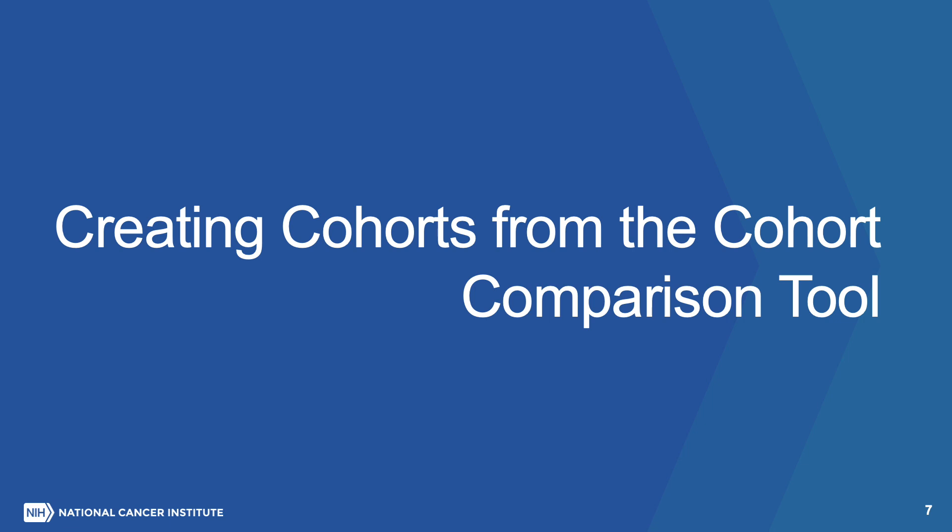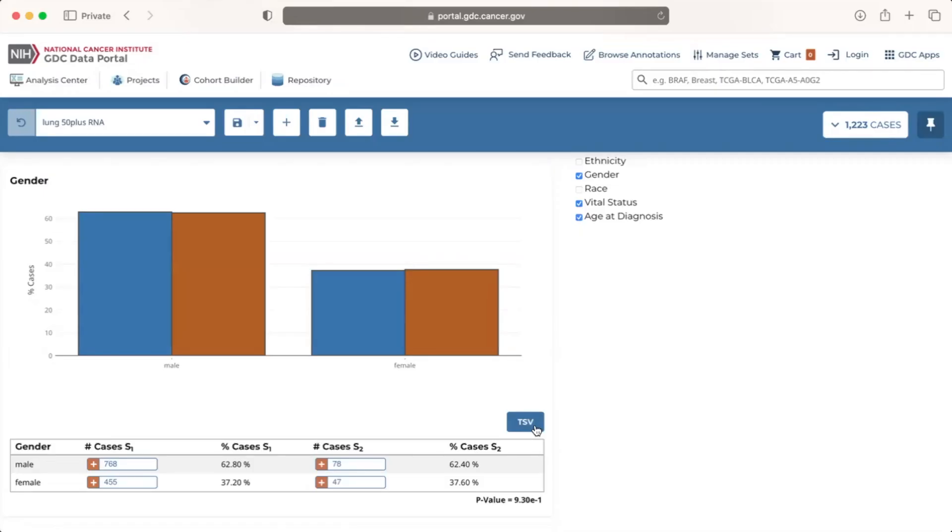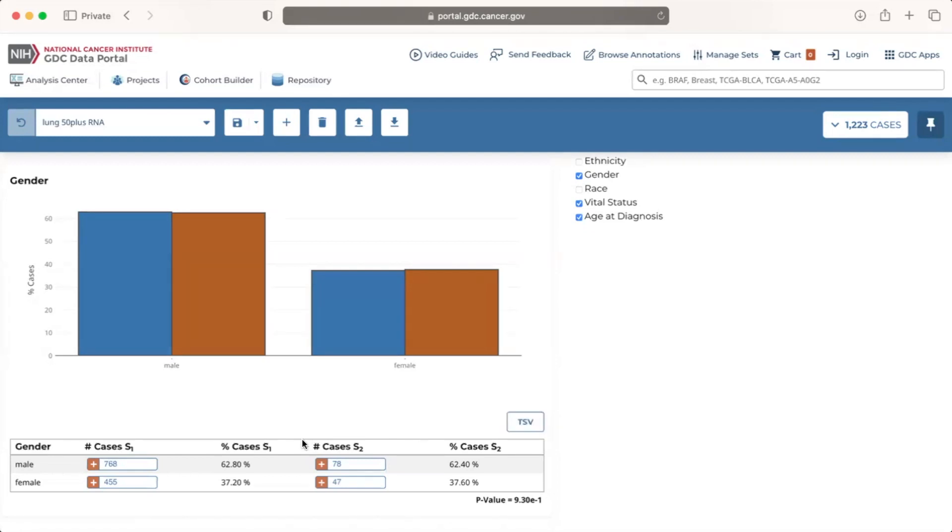Creating cohorts from the cohort comparison tool. Another feature of the cohort comparison tool is that we can create new, unsaved cohorts directly from the tool. Within the data tables are two columns, one for the number of cases in cohort 1, S1, and another for the number of cases in cohort 2, S2.